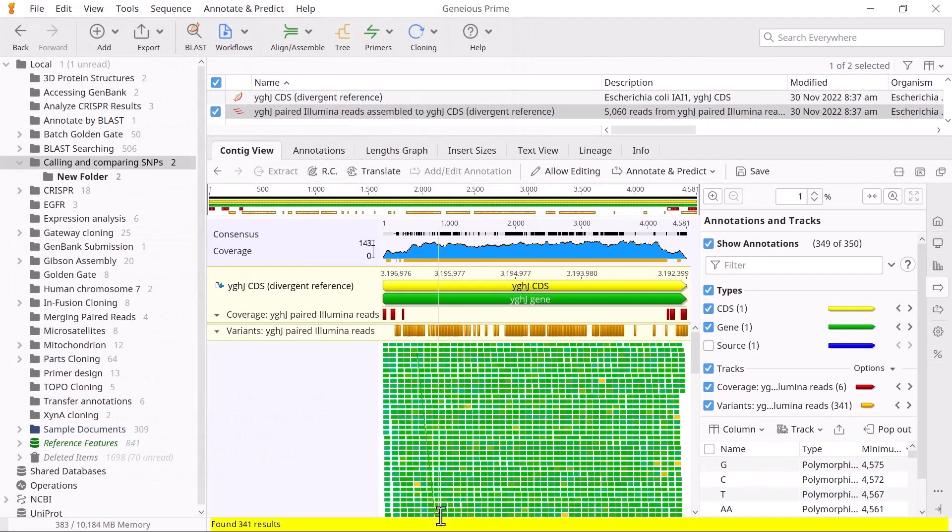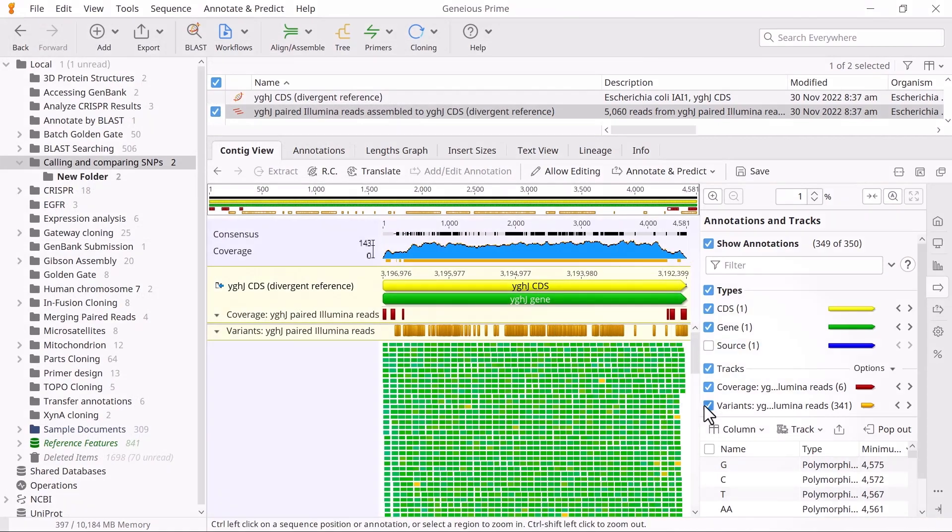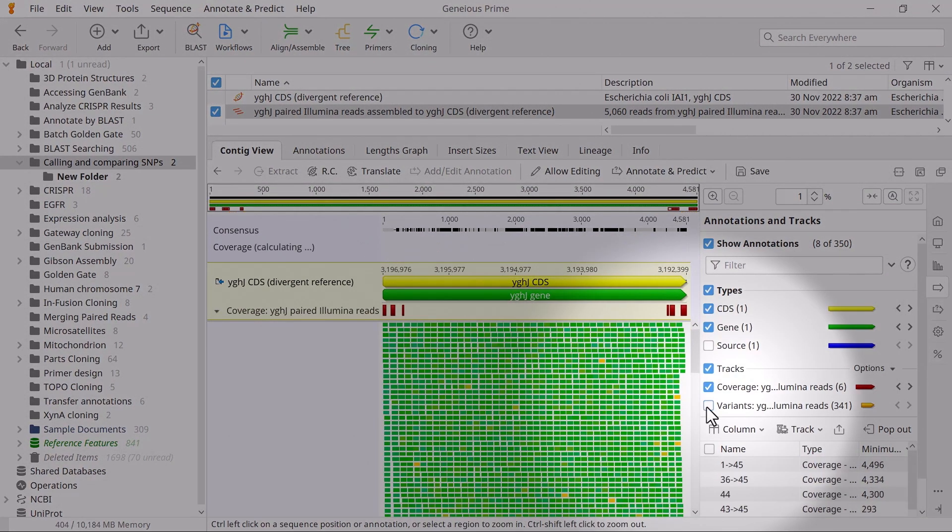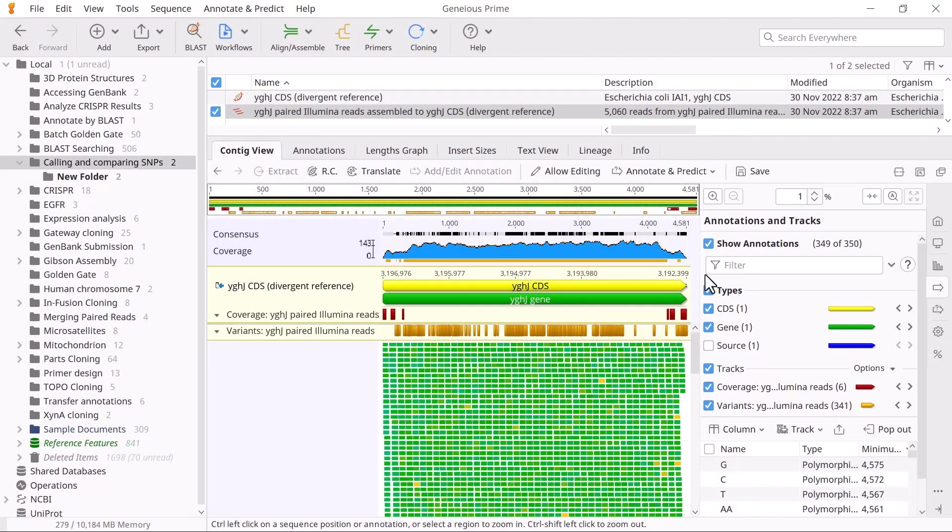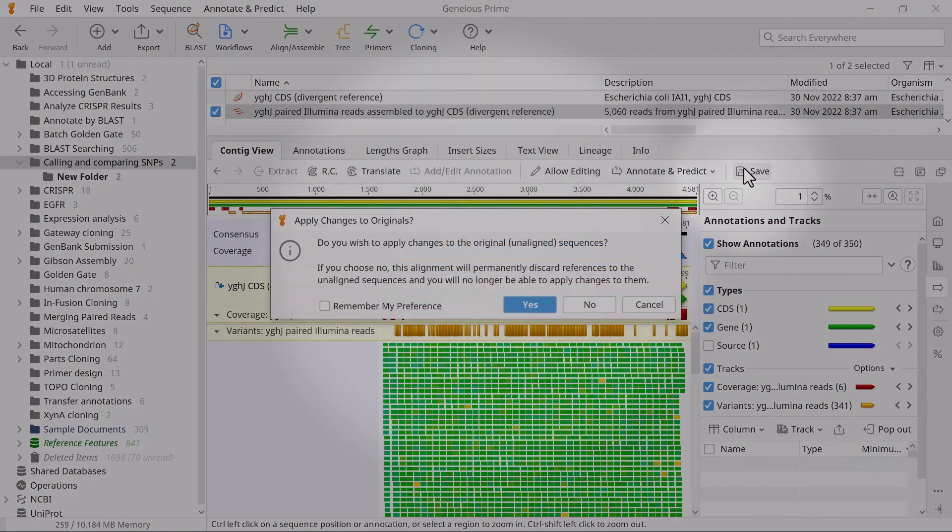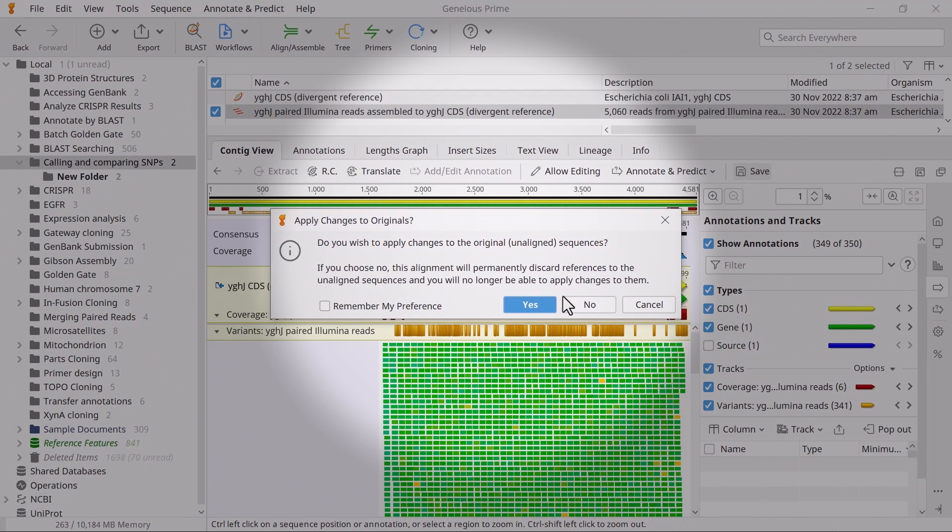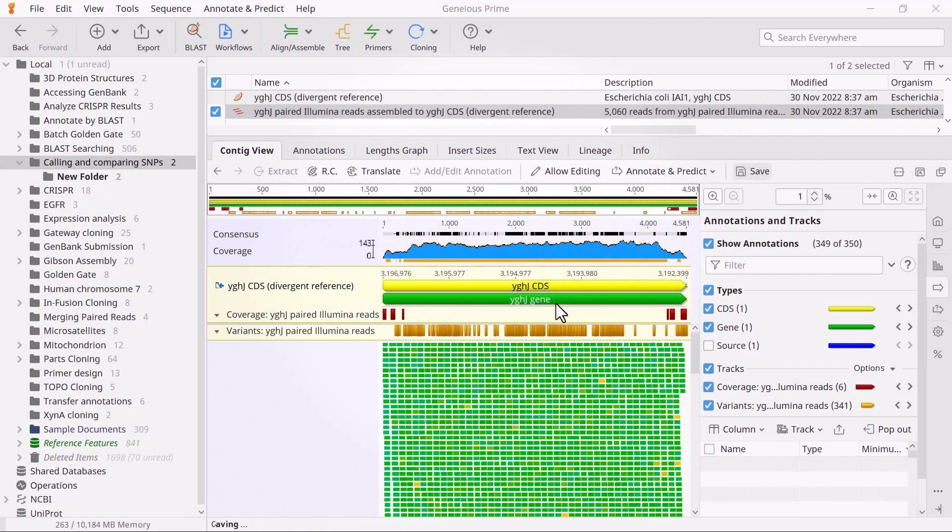You should now see an annotation track labeled Variants. Click Save and choose Yes when asked to apply changes to the original sequence.